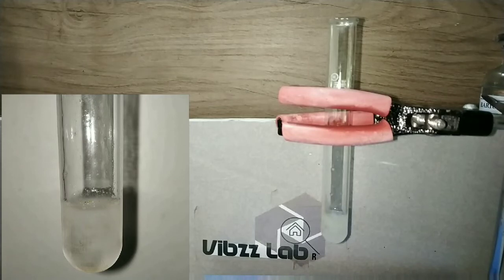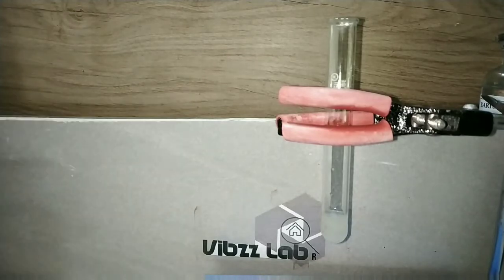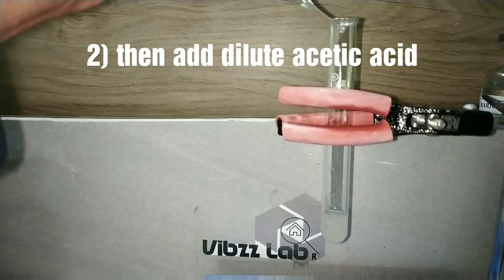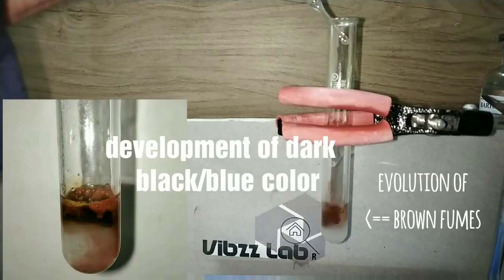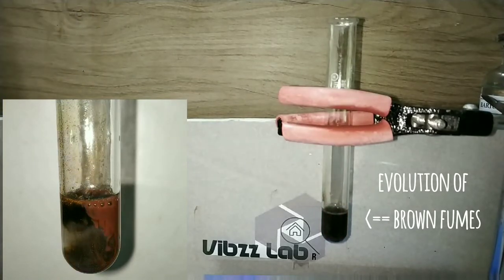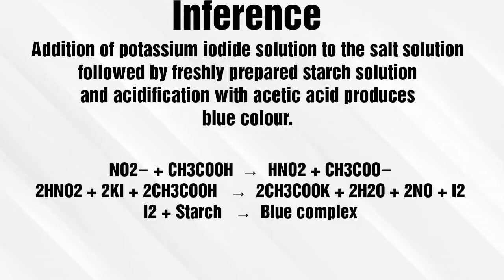So step 1 is to add the starch iodide solution into the aqueous solution of the salt. The next step is to add the dilute acid. Here I am using dilute acetic acid. You can see that as soon as I add the acid, there is development of a dark black to blue coloration. Inference: the iodide is getting oxidized to elemental iodine, which reacts with starch to give the blue colored complex.